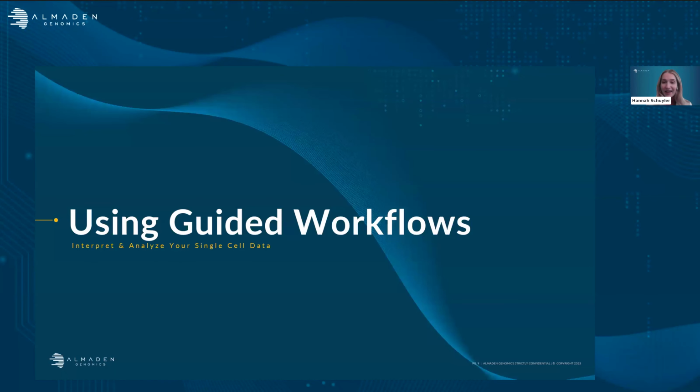And with that, I would love to pass this over to Nora to give a more formal walkthrough of how you can set up a guided workflow on our software and how this will translate into visualizations and interpreting of your single cell data.